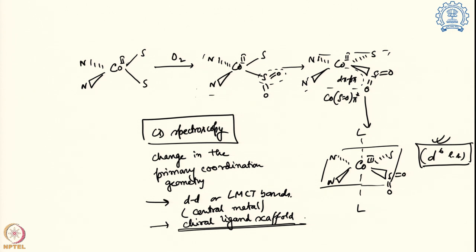You can also have other versions of organic ligand. So, if you have an organic ligand or amino acid or peptide bound metal complex and you try to follow what reaction is happening, you can use CD spectroscopy to follow that reaction and what is happening around the scaffold of this metal cluster. So, this is one of the most important examples of the use of CD spectroscopy for following metal complex reactivity when it has a chiral environment with respect to the ligand, and this chiral ligand is inducing chirality in these otherwise achiral metal based bands.